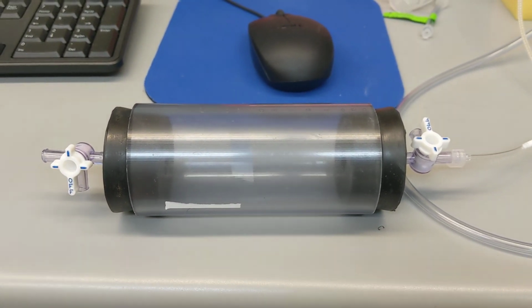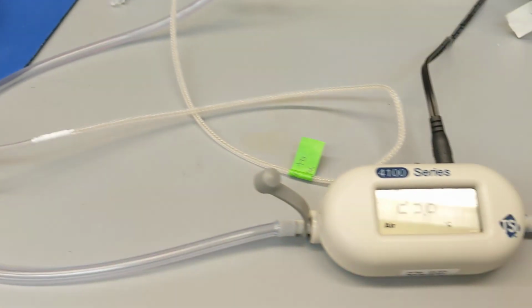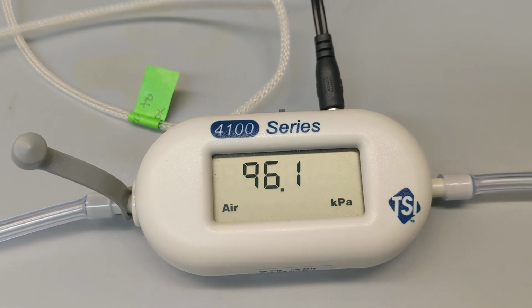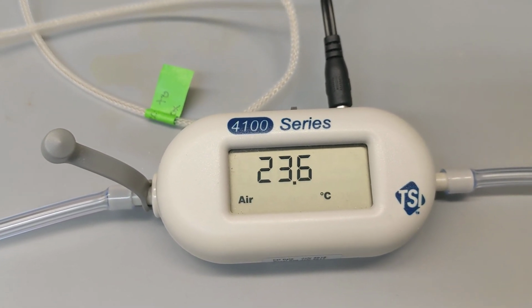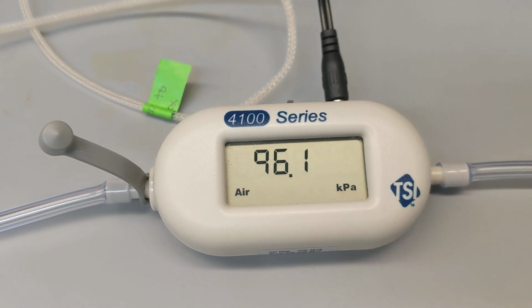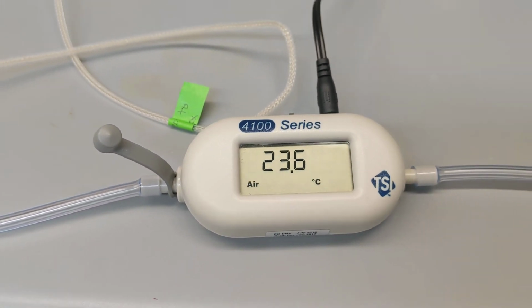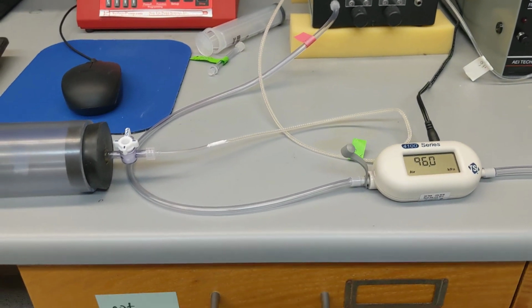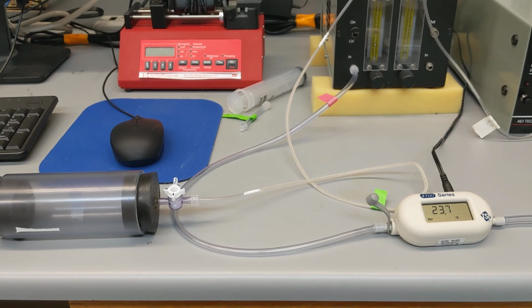The difference between those two values is going to be the oxygen consumption, and it's given as a rate, and we can calculate the rate because we know how fast air is being pulled through this system. The flow rate bumped up a tiny fraction to 0.144 liters per minute. So I'm going to stop this video now, and I'm going to show you another demonstration of what's called closed system respirometry.